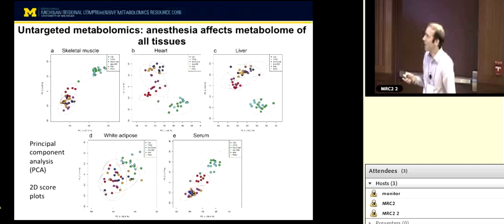We did the study on a time-of-flight mass spectrometer, so it's compatible with untargeted analysis, but also good for targeted quantitation. So this was one of those blended targeted, untargeted profiling methods, and we did full scan analysis, which enabled that. So let's look at some untargeted metabolomics.